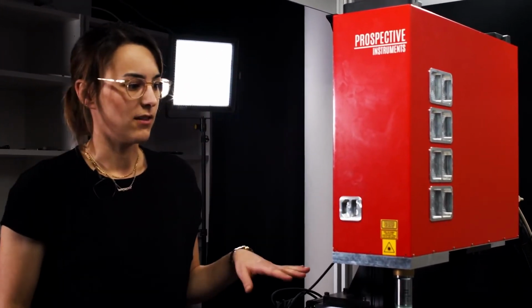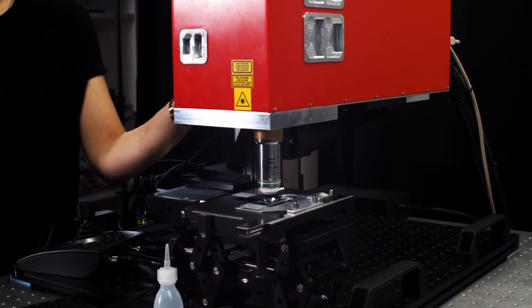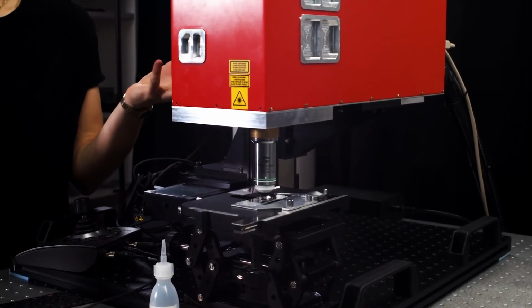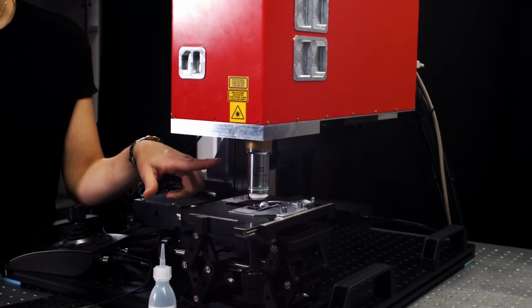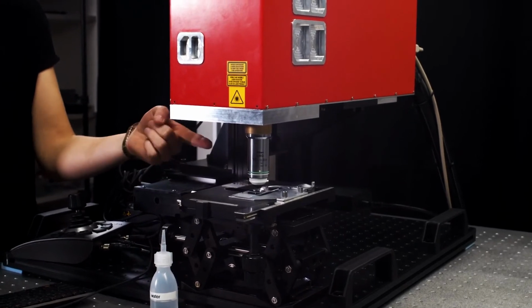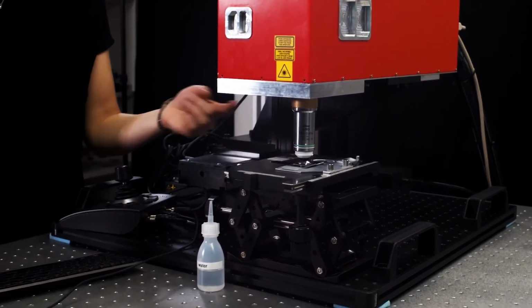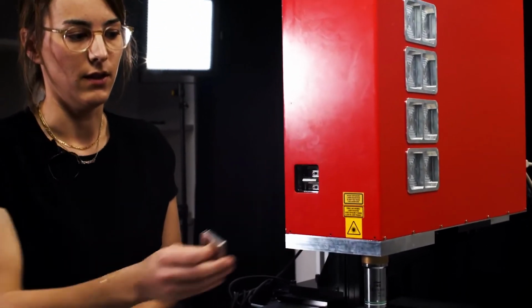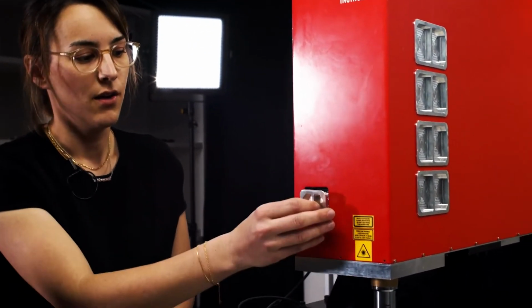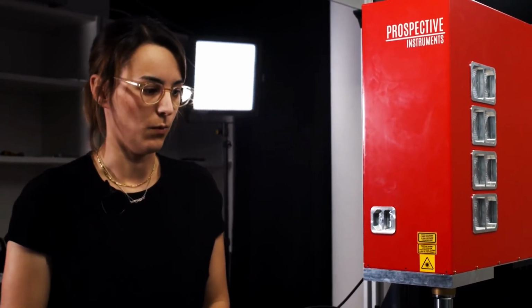As Lukas already said, our microscope today is in the upright configuration, but of course you can just invert the whole setup so that you have an inverted microscope. For today's presentation, I chose a 16x water immersion objective, but you can screw in any objective of your choice with any immersion medium. You have four different positions for that. Over here, you can find the filter cube for the single photon imaging. Today we have pentaband filters that allow us to image five different wavelengths if we want.